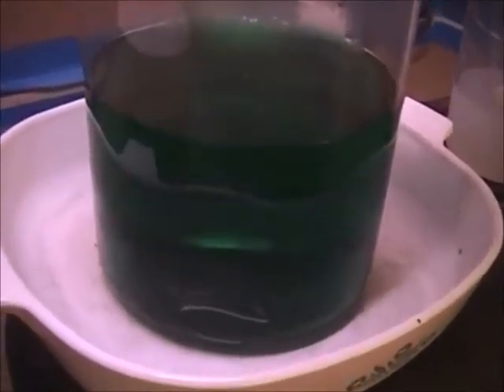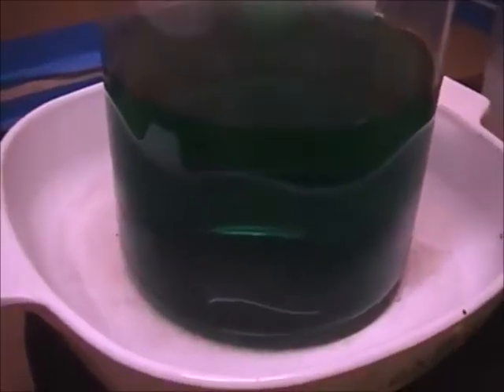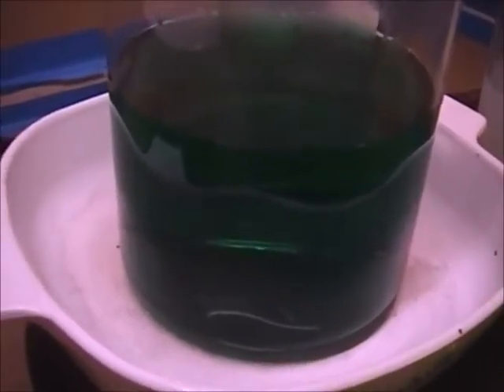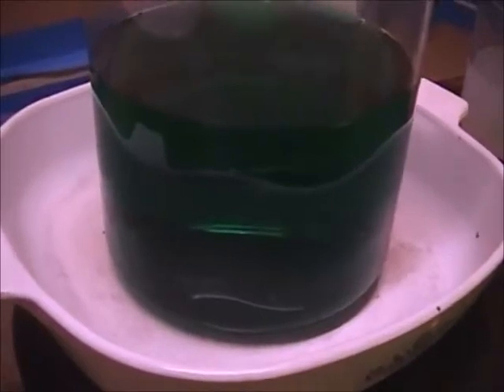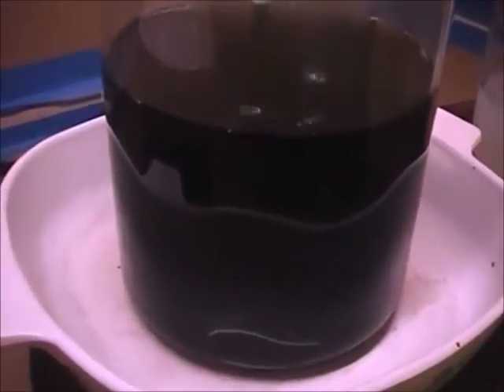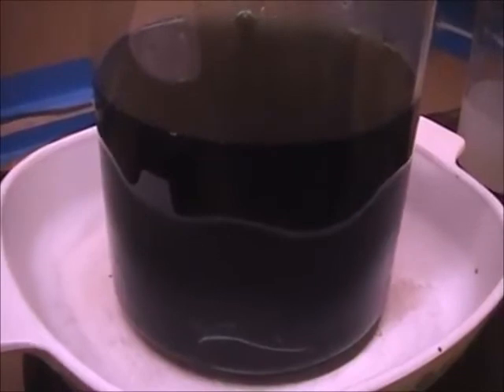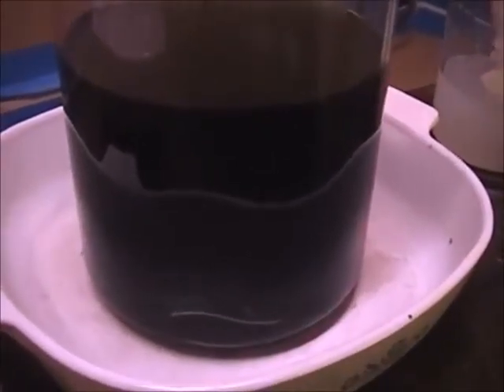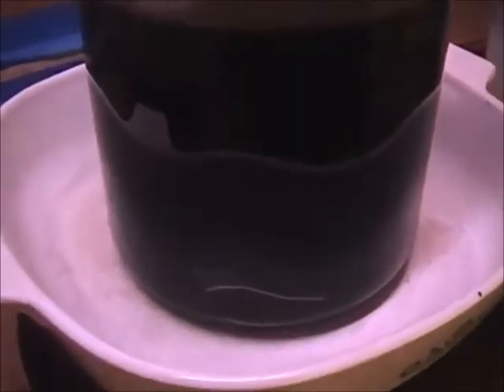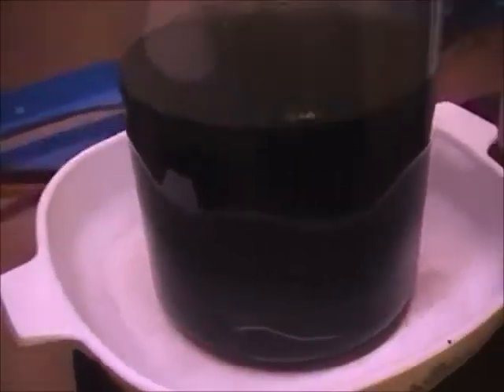If you'll notice, the solution turns black, but then it turns clear again. That's because I probably put excess nitric in there to clear the hydroxides up, so it's causing it to go back into solution. So let's just pour freely. As you can see, the whole solution just turned ink black. Let's give it a moment here. Let's pour just a little more in there, and we'll give the process a minute to start. That's what happened a second ago.